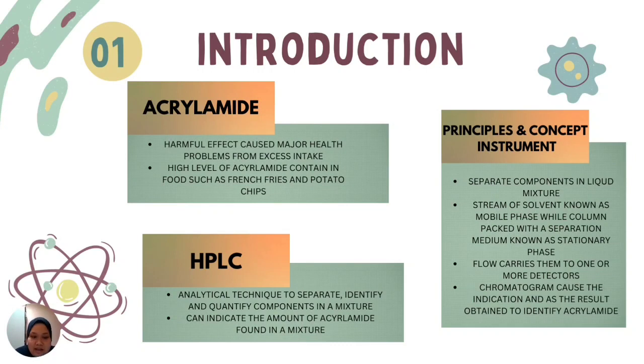Next we have HPLC. HPLC is an analytical technique to separate, identify, and quantify components in a mixture. It can indicate the amount of acrylamide found in a mixture.